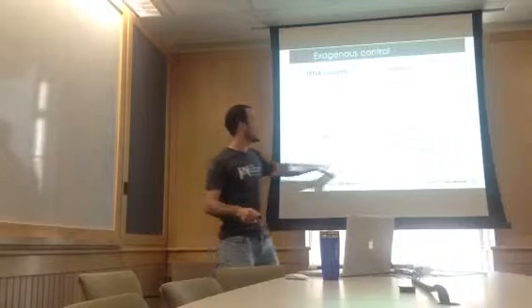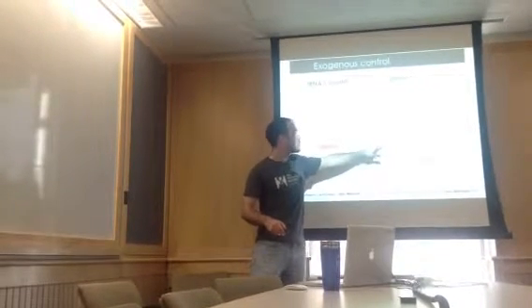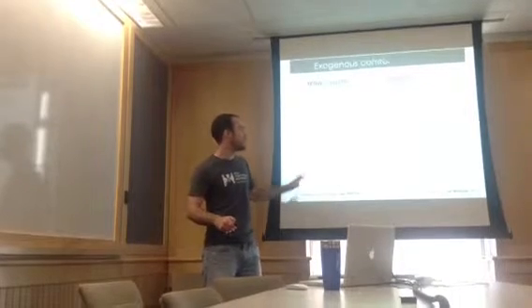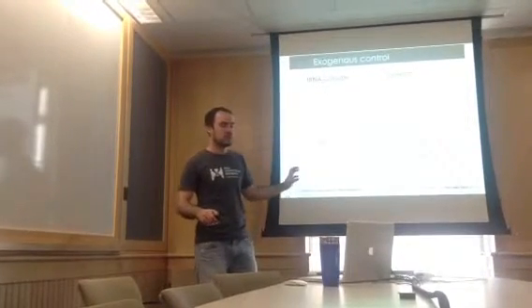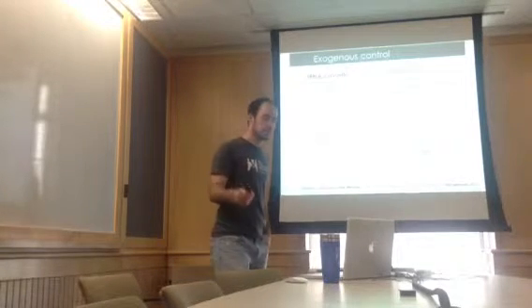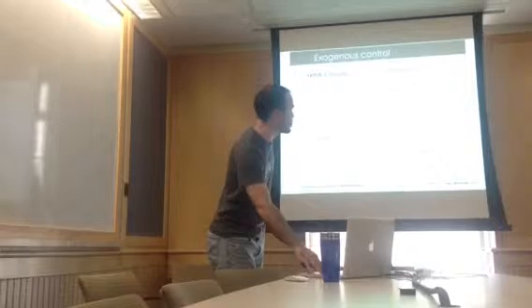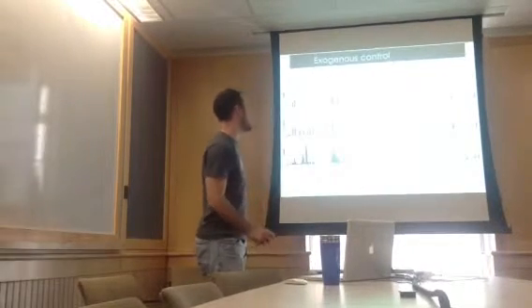So just to let you know that I inserted this tRNA Spinach cassette in the 3' UTR of a transcript, so it will be a good control also to look at the ability of structure-seq to get structural information inside a longer mRNA, a longer transcript compared to the ribosomal RNA.